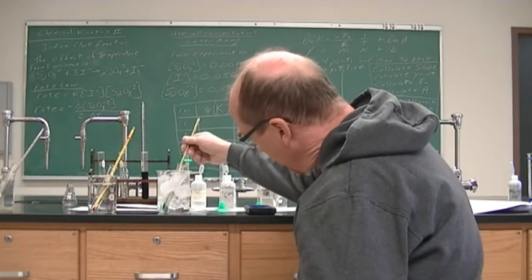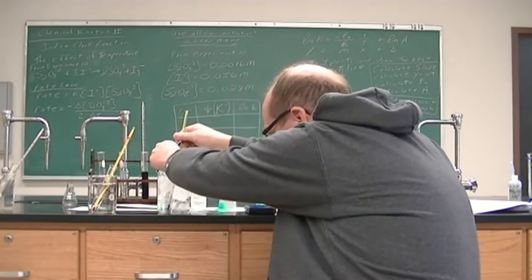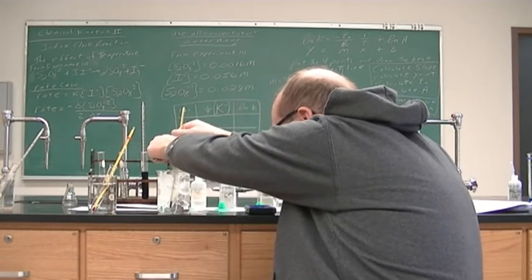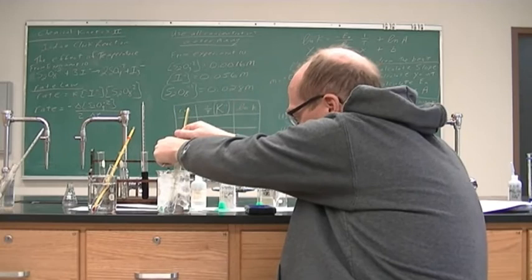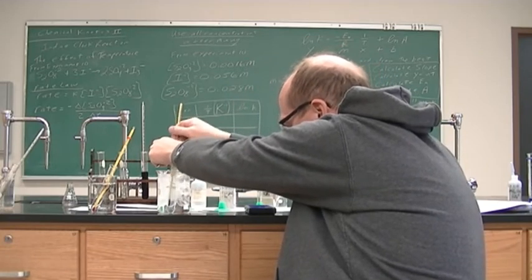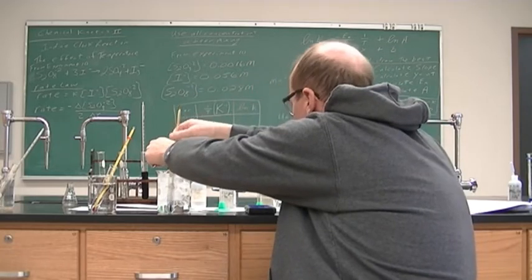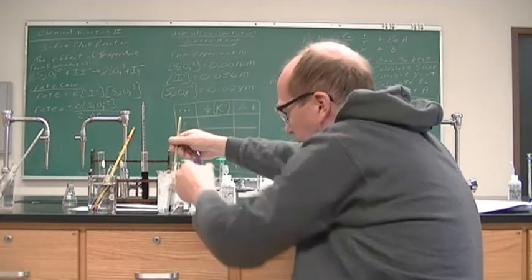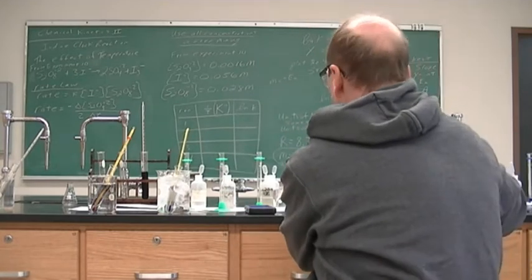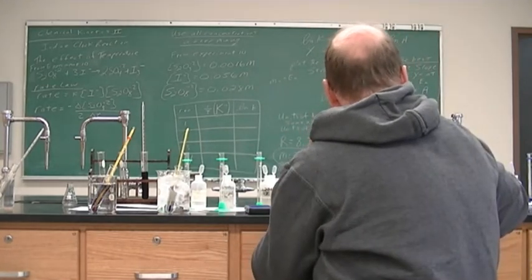Alright, the ice bath is starting to turn. Probably can't see it. But I have to make sure the entire solution is the blue color. Alright, so 8:49. At 8:49, the entire solution is blue. 8 minutes, 49 seconds.